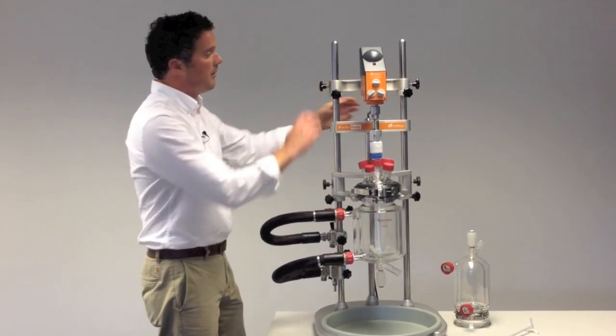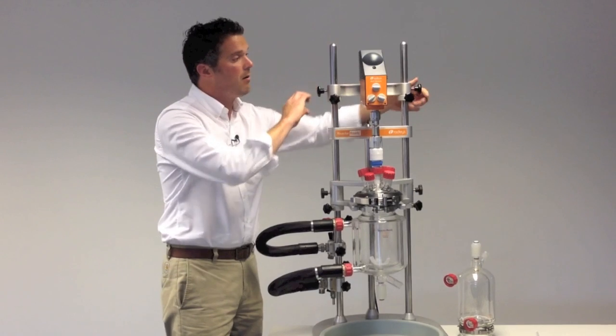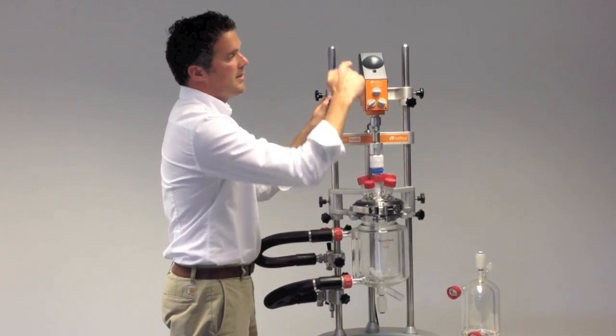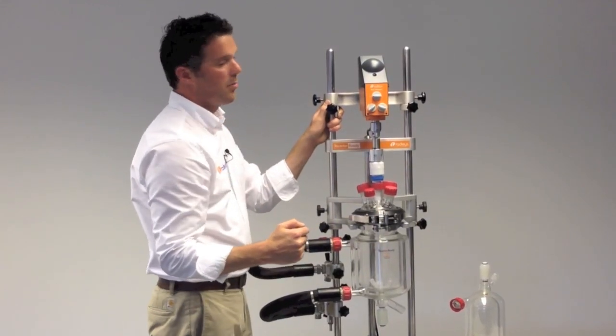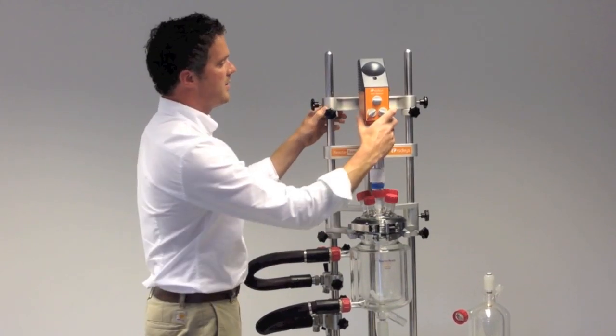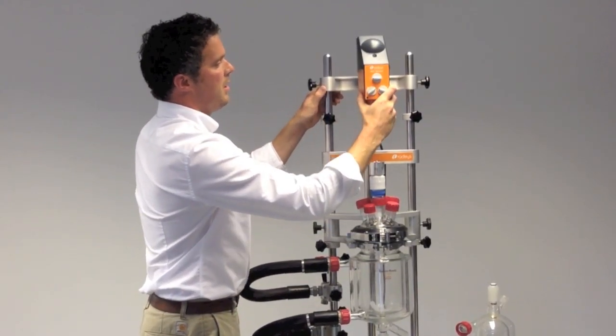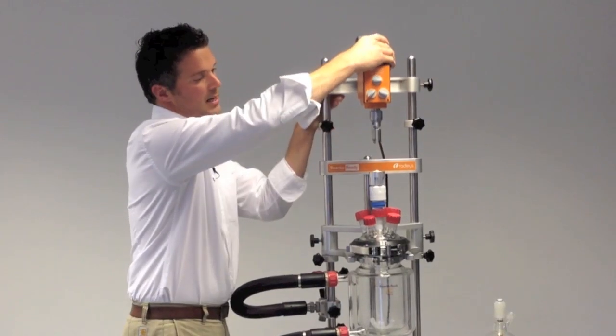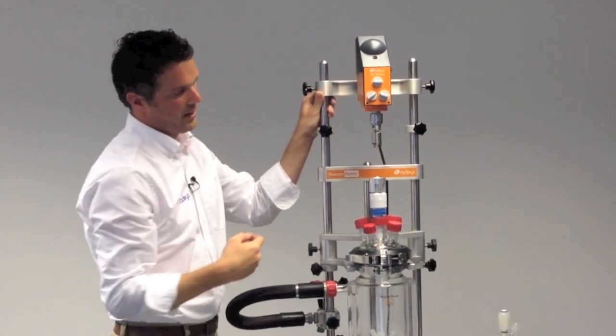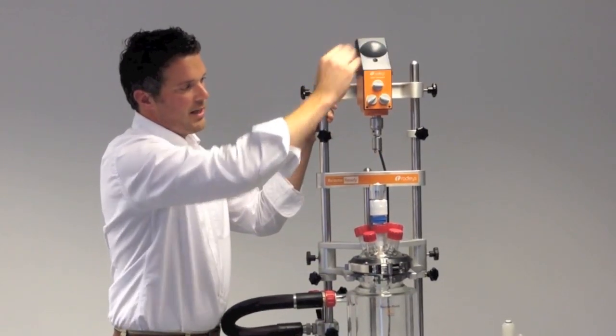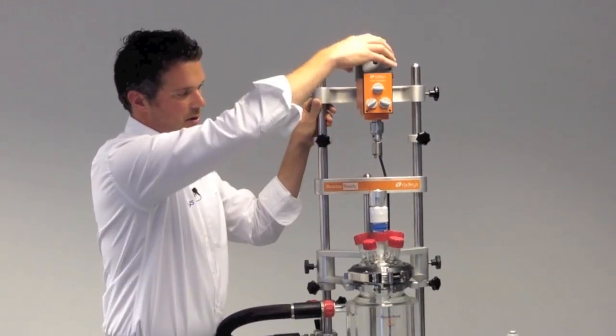At the top of the framework is the I-beam supporting the overhead stirrer. This is Radley's overhead stirrer but they'll accept most major overhead stirrers. Once you've undone the sides this just slides up and you can see here is the three pin drop-in coupling. You don't need any tools. This is what connects it to the stirrer shaft.